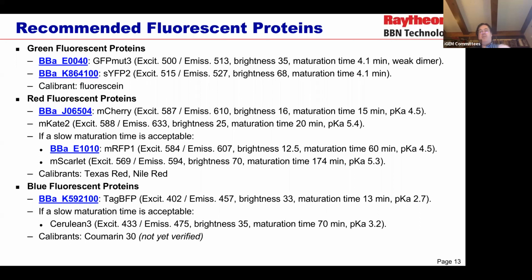These are based on both experience, things that people have found very easy to use and fairly comfortable, and also their frequencies, brightness, maturation time, and low sensitivity to pH changes. So this is something that you can go and look up afterwards if you want. There's information on the measurement committee page.